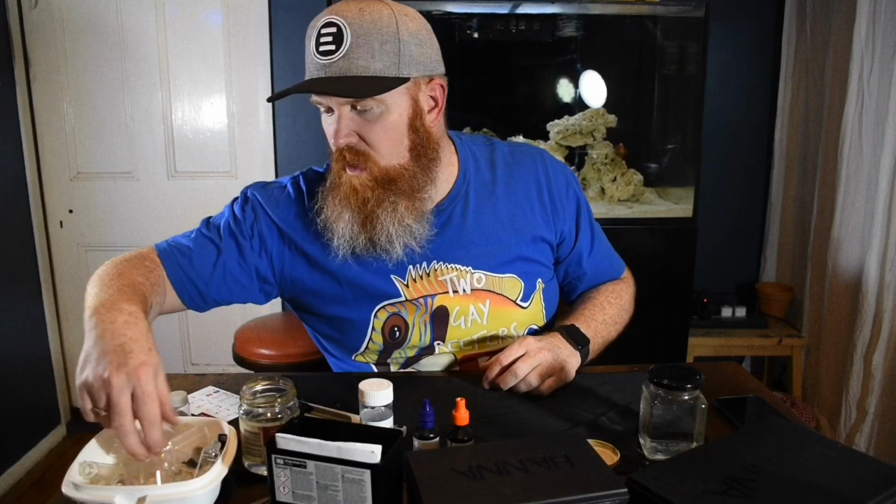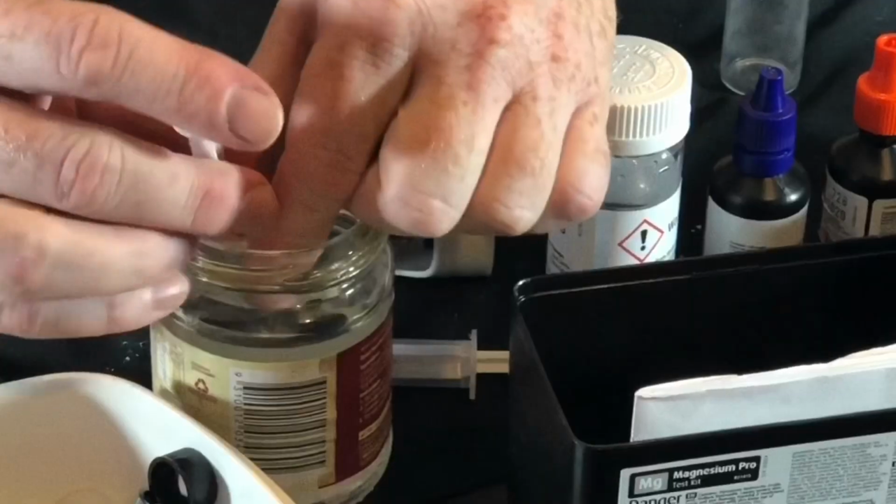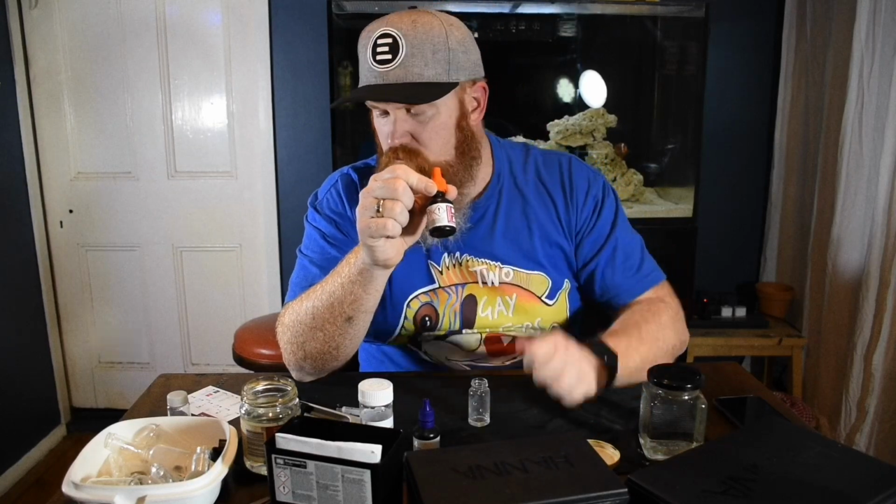Grab yourself another clean vial. All right, you want to grab 2 mils of salt water from the tank you're testing. All right, first step is to do 1 drop times 5 with a 15 second mix between it. This is the part I hate.